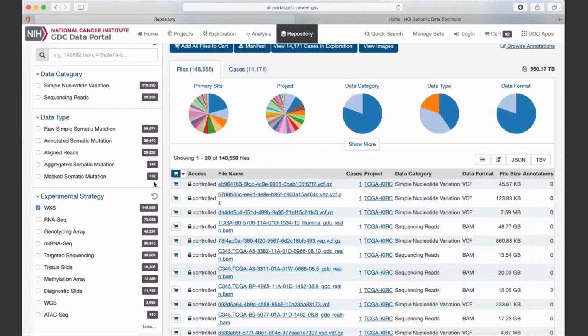We do have some other GDC-implemented specific germline variant filtering, such as looking at the normal depth, making sure the normal pair has enough depth at the variant position, and also requiring the variant to be in the exon regions and within the capture kit region. There are some other small filtering steps we did, but the two-callers criteria is the main thing we did for the multiple caller aggregation.